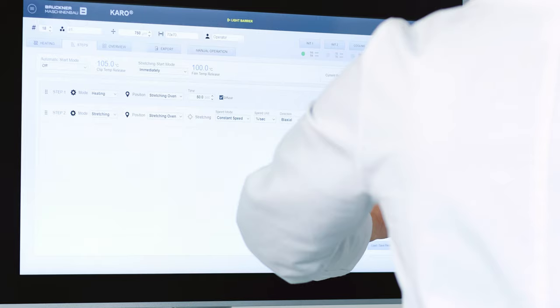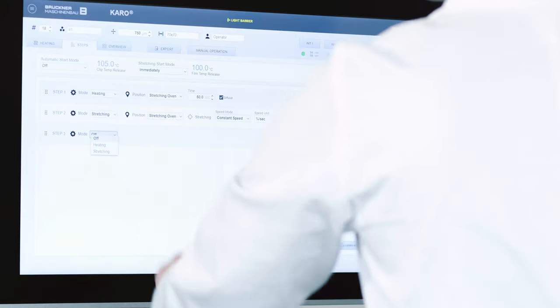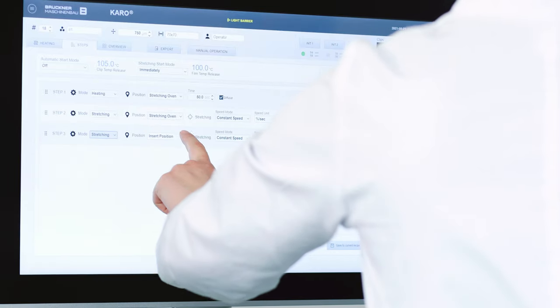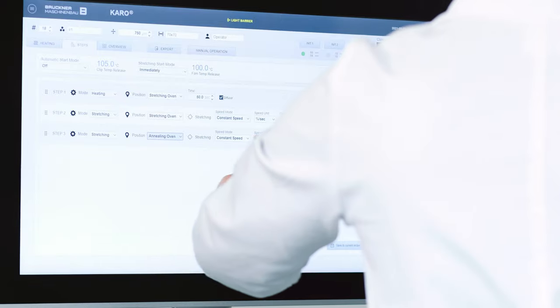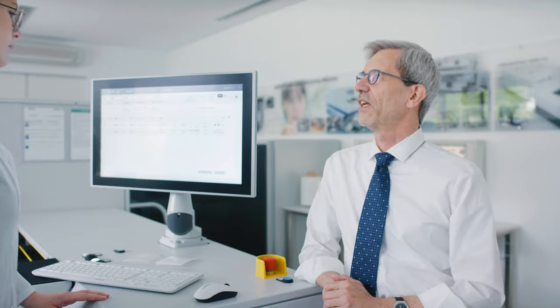In the next field, you will enter which stretching ratio you want to test and the actual stretching speed. Now we will add a new step — that is our film relaxation, in which we want to relax the film by 3%. This will be done in the second oven this time, and we will once again enter all the relevant parameters. As you can see, all parameters can be adjusted with just a few clicks.